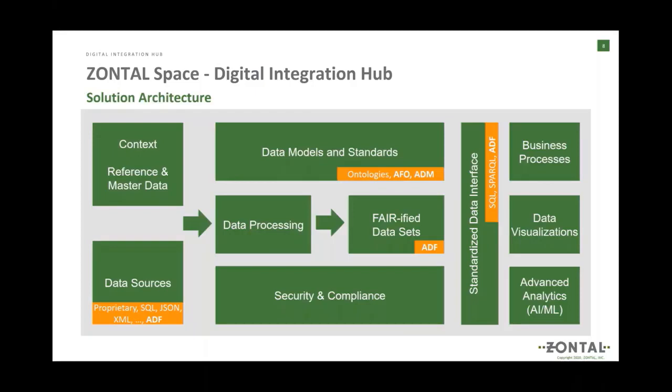So what we see here on this picture is more than the technical view. On the left side, we have various data sources, and these can be in proprietary format, SQL databases, JSON or XML files, or of course, increasingly also ADF files that are provided, for example, by the instrument vendors.